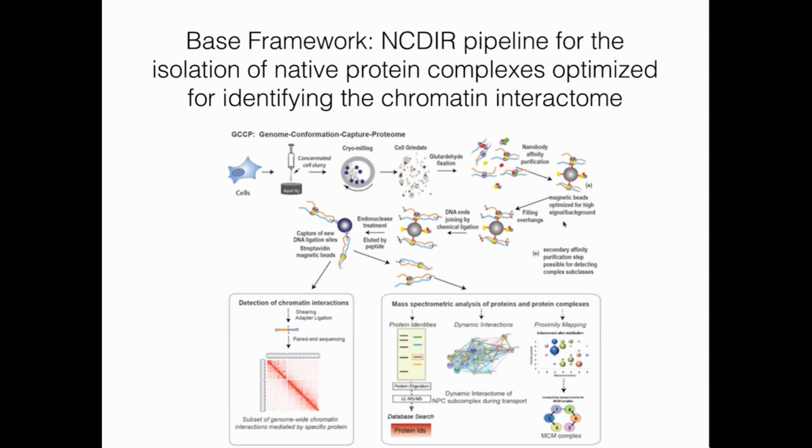Okay. Anyone else? Yes, this is Andy Belmont. I'd like to jump in on a similar question. I was intrigued by your microscopy, so I'm wondering if you've actually measured the size of the type of pieces you get. The second question is, we tried something years ago where we were pulling down something with lac operators with GFP antibodies, GFP against repressor, but we found in our salt conditions we were getting large aggregates.